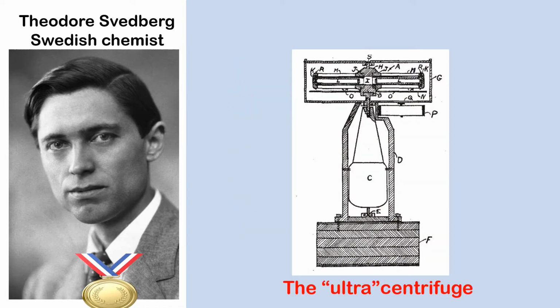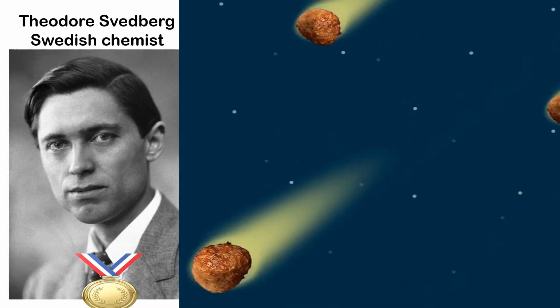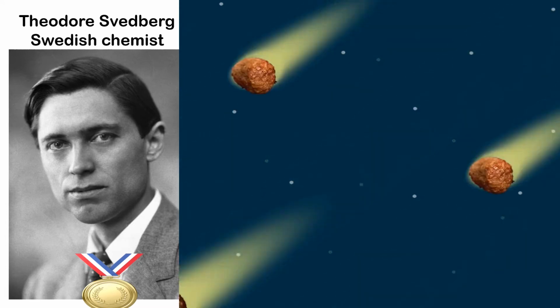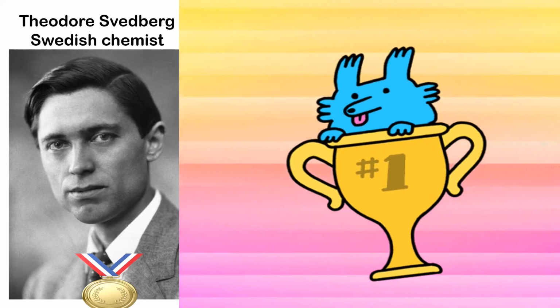To settle this debate and also to conduct further research on colloids, Theodor Svedberg then invented something that he called the ultracentrifuge. Now, ultra here does not refer to the present day ultracentrifuge. In fact, it was just a name that he gave to the centrifuge that he developed, this contraption here. This was able to reach centrifugal forces 5,000 times the gravitational acceleration, and in fact, it did lead to many catastrophic accidents in the lab when metal shards would be hurled around the laboratory. But he did end up proving that proteins are in fact molecules, and for that he earned a Nobel Prize in chemistry.